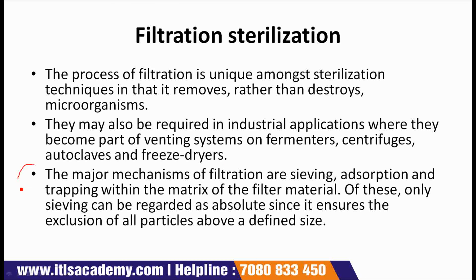Next point, the major mechanisms of filtration are sieving, adsorption, and trapping within the matrix of the filtered material. Of these, only sieving can be regarded as absolute since it ensures the exclusion of all particles above a defined size.